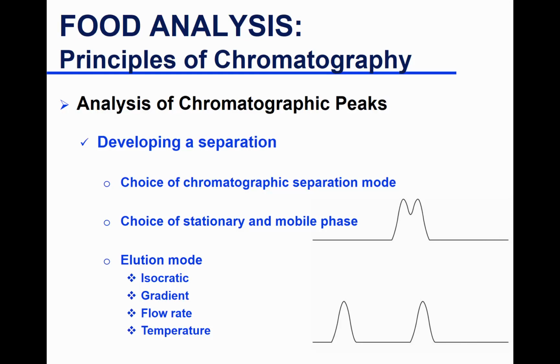When you increase temperature, what do you think happens to the movement of the solute between your stationary phase and the mobile phase? Does it go fast? It speeds up. So the velocity speeds up. And what do you think happens to the viscosity of your mobile phase? Does it go up or go down? It goes down. So viscosity goes down. It helps the solute to move fast. And the solute itself, kinetics would make it move faster. Then you will have faster equilibrium, sharper peaks, and better separation.